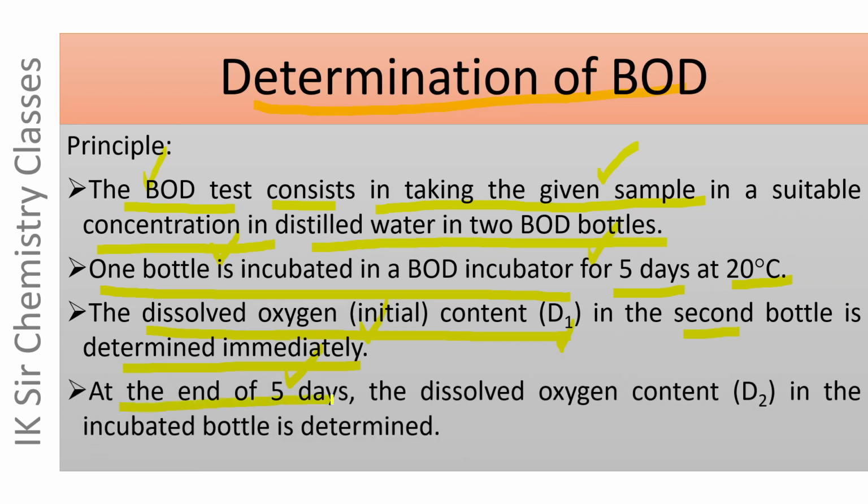At the end of 5 days, the dissolved oxygen content, that is D2, in the incubated bottle is determined.